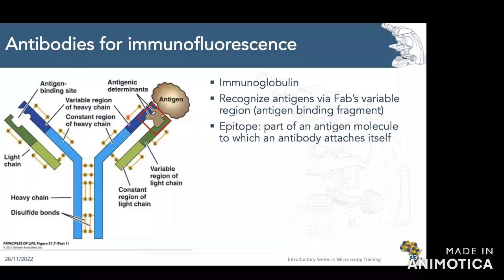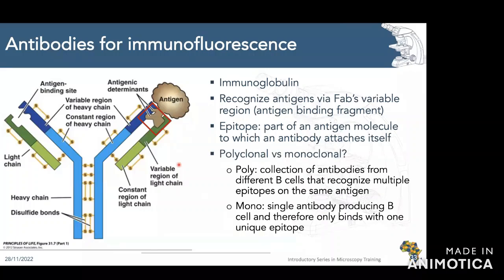Look at getting Fab fragment antibodies that work really nicely. I've been using that at the moment, and they're much smaller than these large immunoglobulins. So just a touch on polyclonal versus monoclonal. I have students ask me this often.